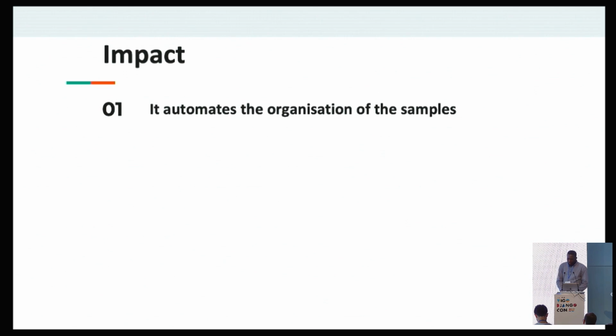The other aspect is, why do we need to use a laboratory information management system? The first thing for us is, how do we serve our patients effectively? How do we organize our samples? By building a laboratory information management system, we merge all the samples together. So samples can come in on Monday, on Tuesday. We have to store them in storage called the awaiting rack.